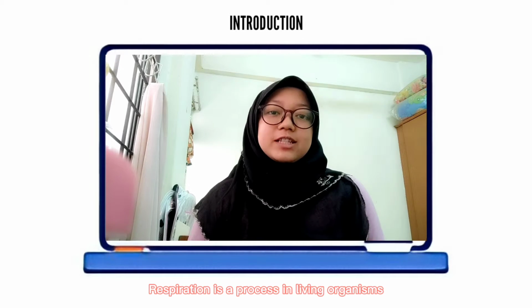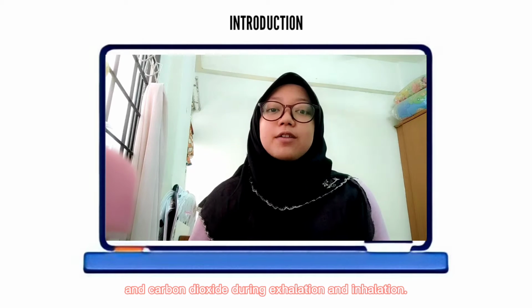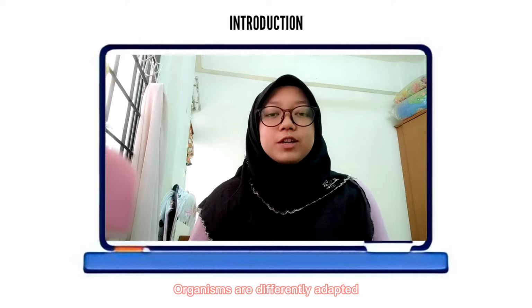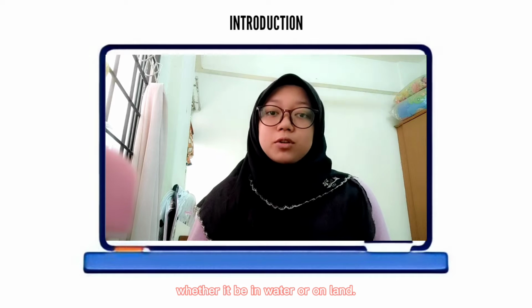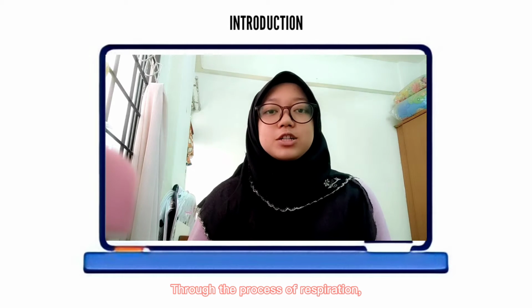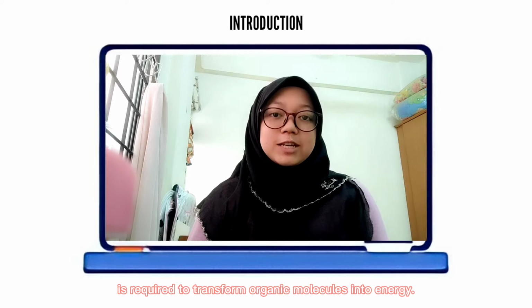Respiration is a process in living organisms involving exchange of gases, oxygen and carbon dioxide, during exhalation and inhalation. Organisms are differently adapted, so gas exchange can take place whether it be in water or on land. Through the process of respiration, oxygen in particular is required to transform organic molecules into energy.